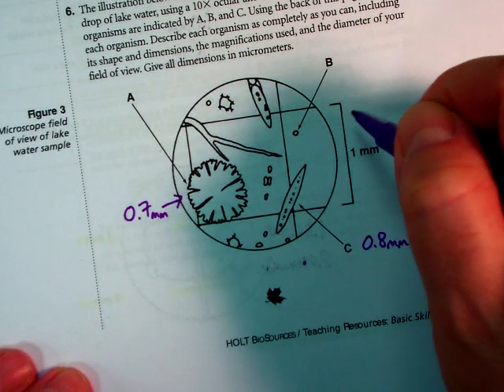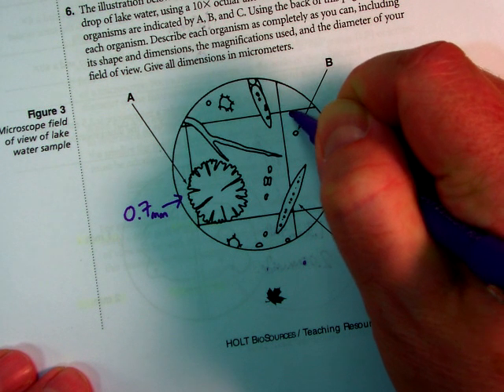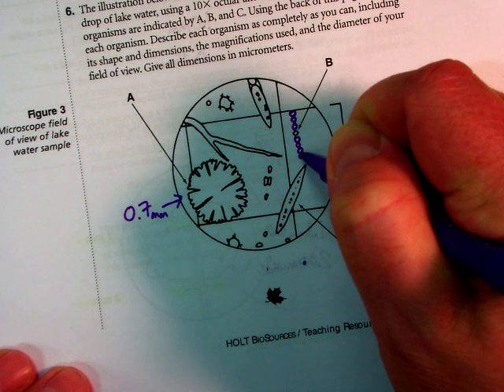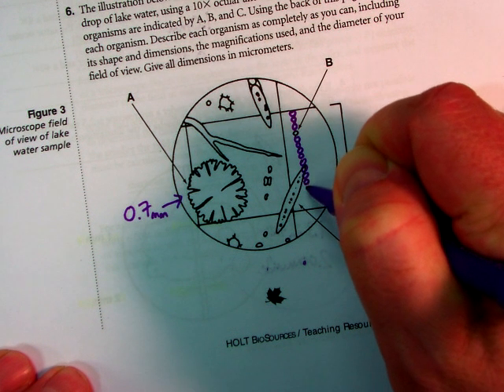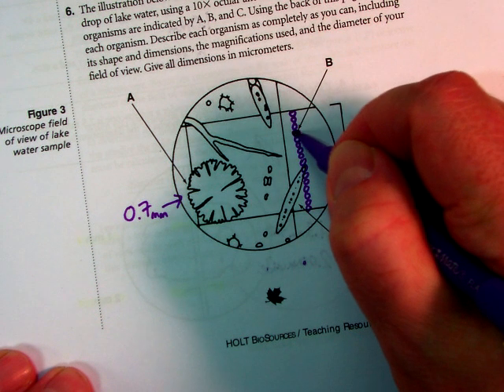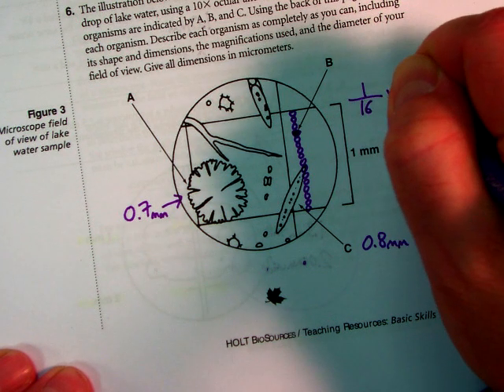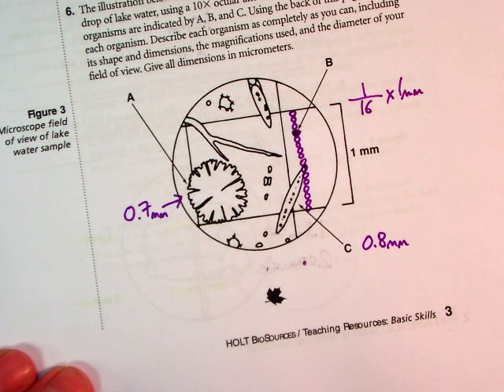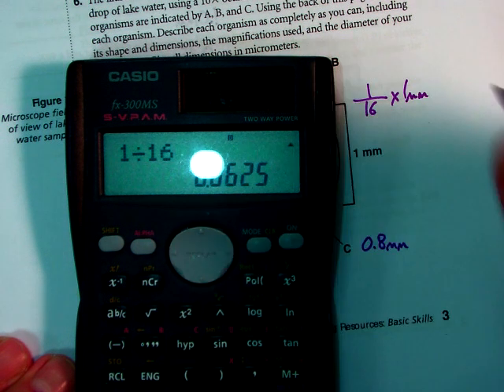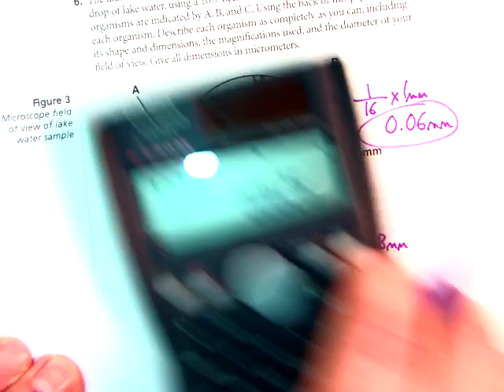And finally, this little one, we have to kind of estimate how many can we fit in here. 1, 2, 3, 4, 5, 6, 7, 8, 9, 10, 11, 12, 13, 14, 15. I can fit about 16 in there. That means this little guy here is about 1/16 of 1 millimeter. So it's about 1/16 times 1 millimeter. This is all estimation. So 1 divided by 16 is about 0.06 millimeters for B.